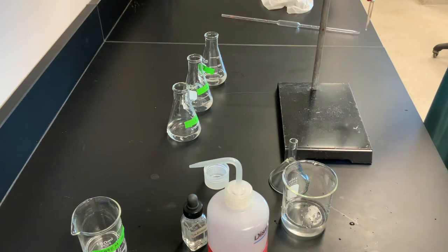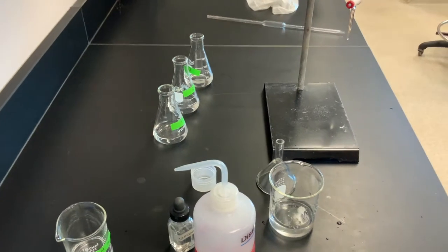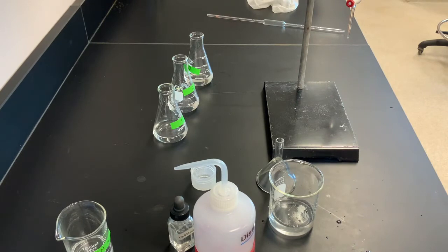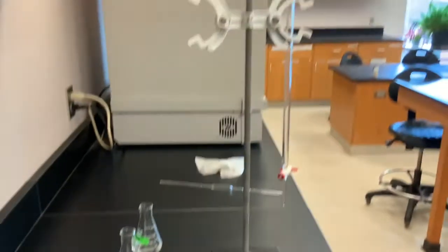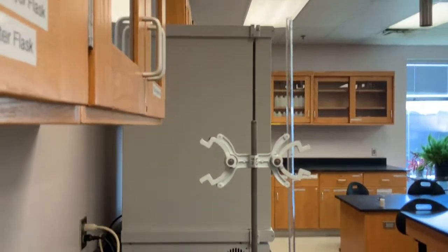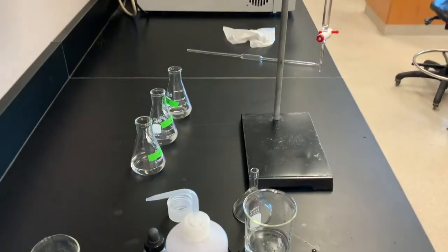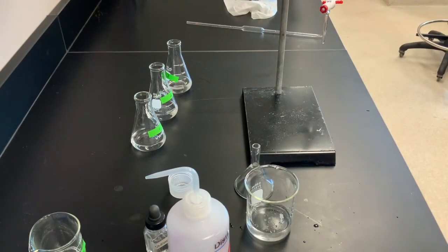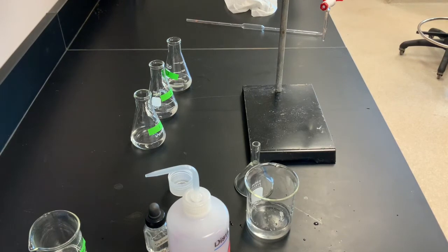So we're going to take our burette and return it to our burette holder. So we've got it in our burette holder. And what we're going to do is lower that burette so that it becomes eye level. We're going to pour our sodium hydroxide into the burette up to the zero mark, so that we can titrate with it.